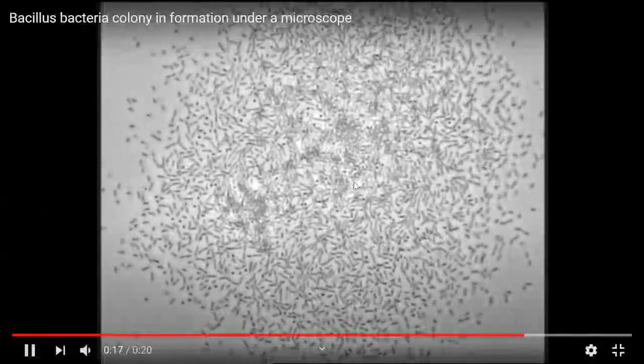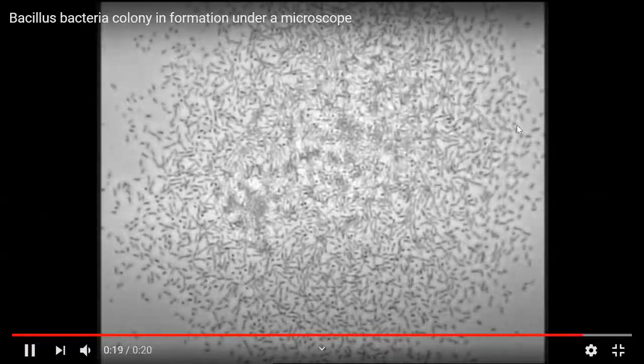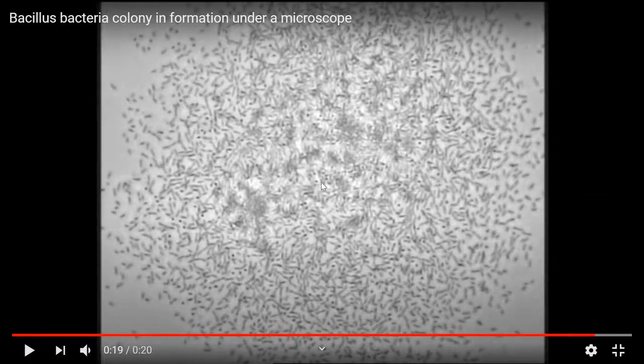Notice how in the middle here, it's thickest and most dense with bacteria. So over time, this is where spores will start to develop, right? But if the colony is small, it's still too young. You'd have to wait for the colony to get old, and then you'd look in the center here, and that's where you would find spores. You can see how much thicker and denser it is in here.